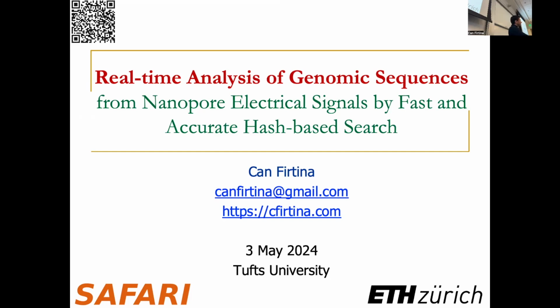There's this locally consistent hashing. Are you looking at this now? We have a paper about this, BLEND. I can talk about it a little bit, but you can finish your question first. Looking at versions of the hashing where, if your k-mer is off by 1, you hash to a similar value.